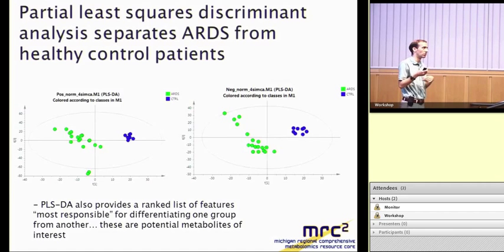Talk to people like George and Ala about what is the best way to go for your data set. Usually the first approximation is just to take your raw data set and put it into PCA and PLSDA and see what you get out of it. If you don't get great separation, it doesn't mean there's not meaningful information there. It may just be that you're losing some signal to the noise, and then you need to take those further advanced steps of doing some filtering.